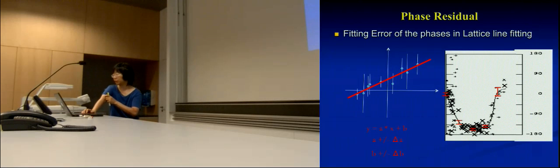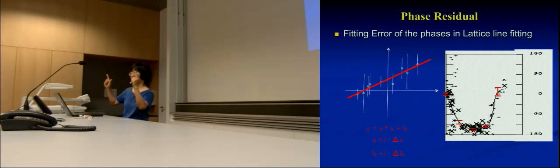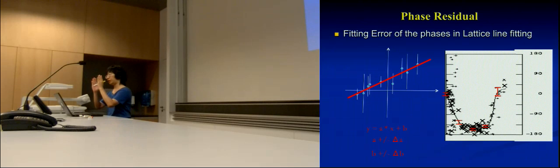I looked at Fabian's data, and the sampling he used as the C values seems to be a lot larger than the envelope value. That's okay to do, but what you will see is that you have a lot of points where it's sampled that will have the same error value, because it doesn't actually recalculate the error in between.